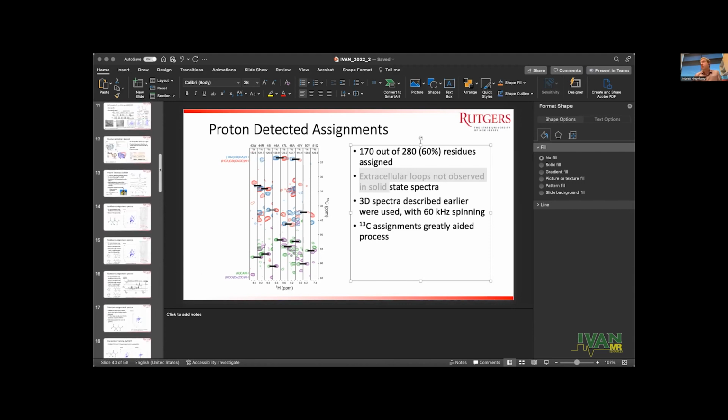No, I don't. The same way you reintroduce a dipolar coupling with a train of pulses, you can introduce the CSA in the indirect dimension as well. And we do that. Line fitting gives you a lot of really cool information, right? And so you get a lot of control in solid state NMR. You have to deal with very broad lines relative to small molecule solution NMR, which is why I always say, you know, exhaust all other options before starting to do solid state NMR. But at the end of the day, when there's nothing else left to try, solid state NMR will still be there if you want some site specific dynamics of something that's way too big to do anything else on.